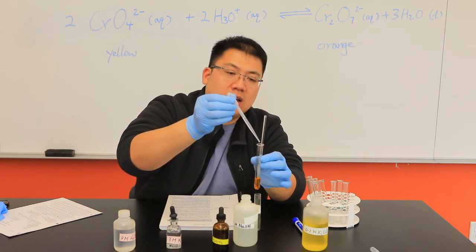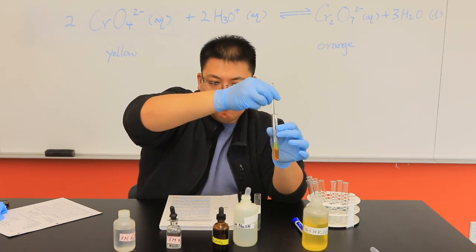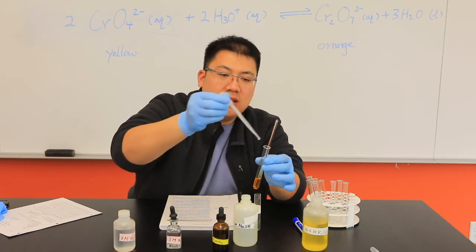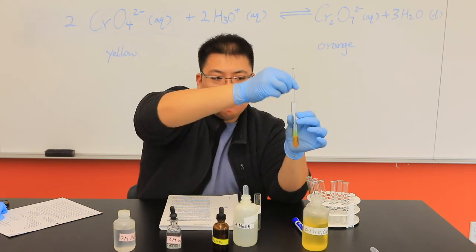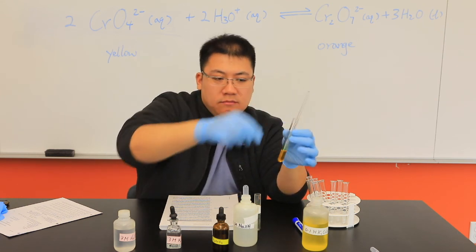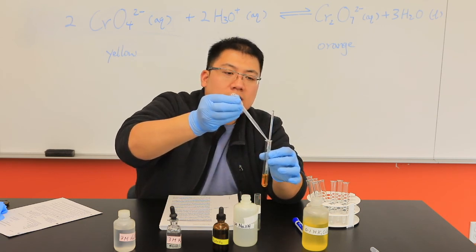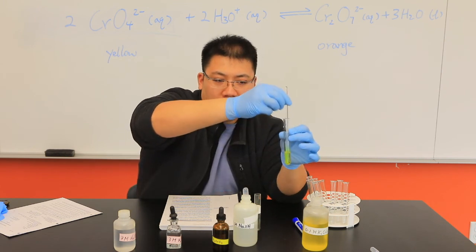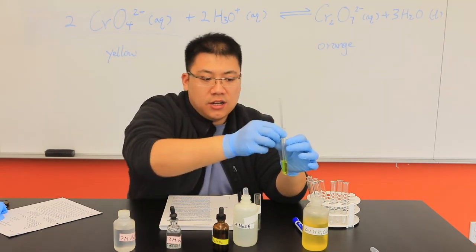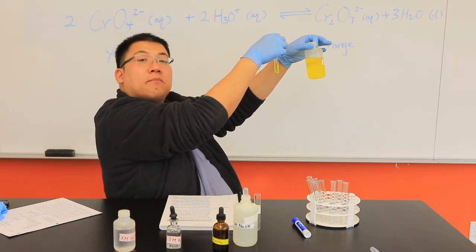So I'm just going to add a couple drops. Mix it. Add a few more drops. Mix it again. Okay, you can see the change. Now the color is changing back to yellow.